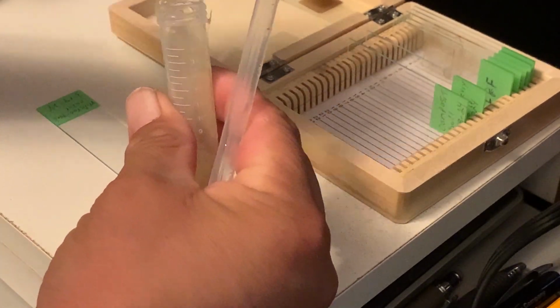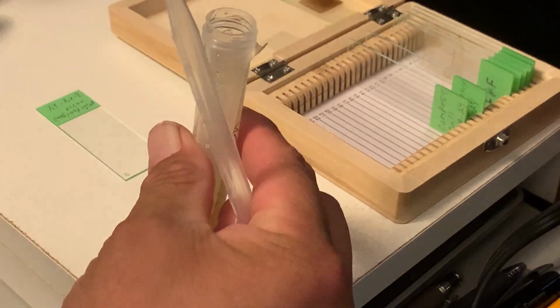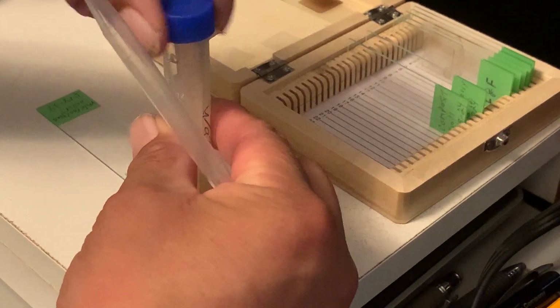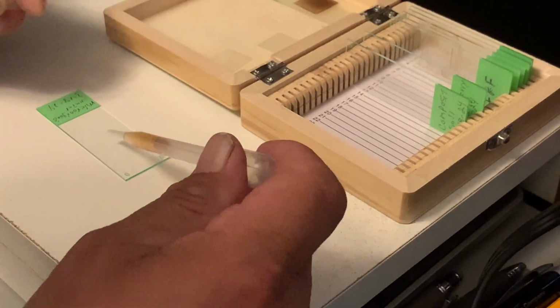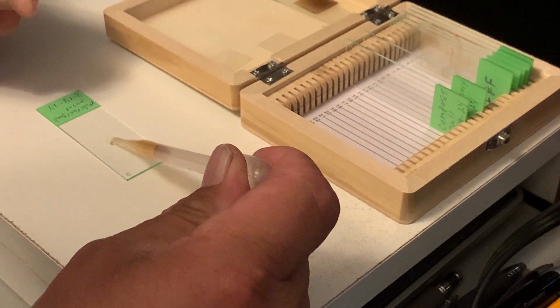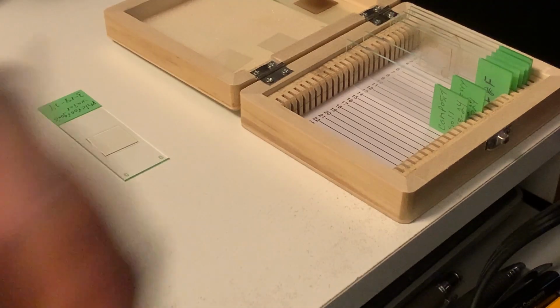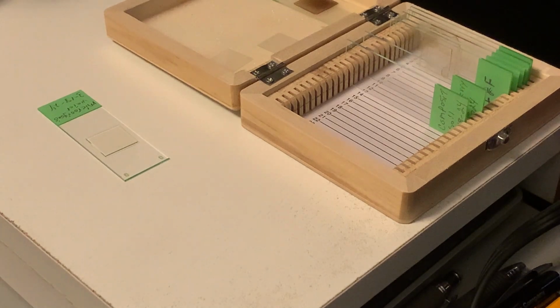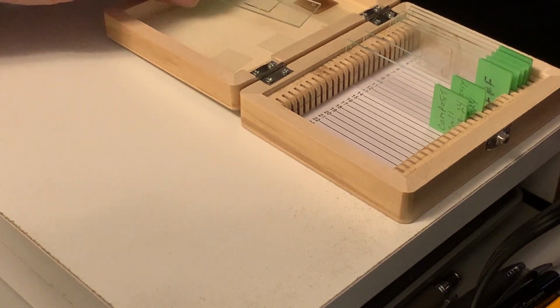Okay, let's take this out. Let's put this over here. And now, just a little drop. Okay. Now let's put this with the sample core. Test tube. Whoa, it looks like it's kind of wet.